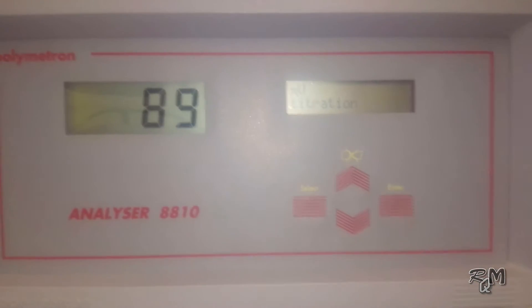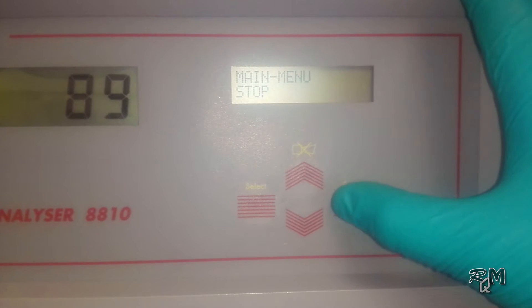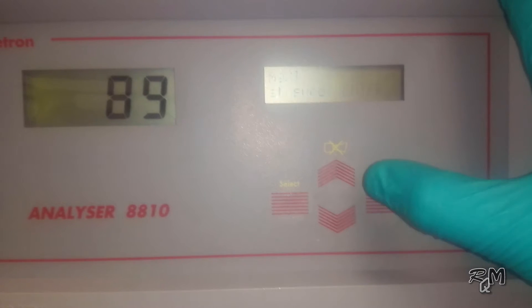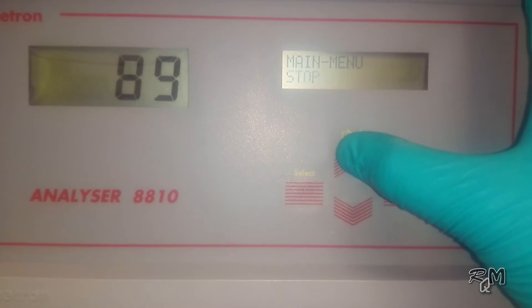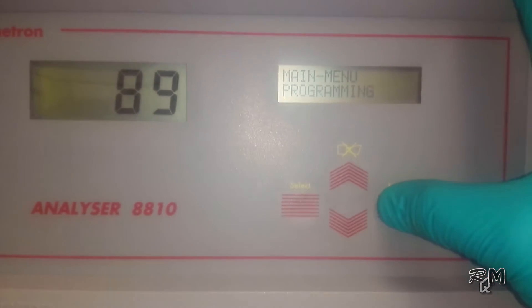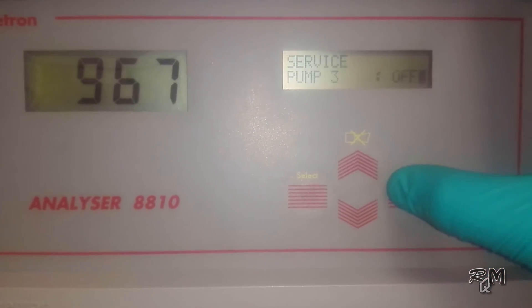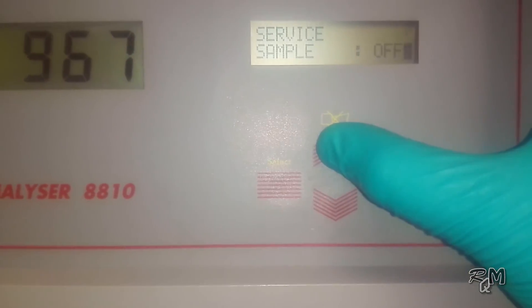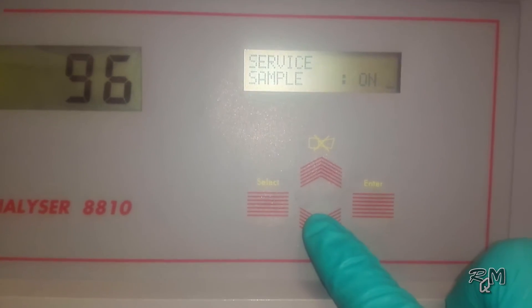For volume verification we will again use the service menu. If the analyzer is in service, first stop the analyzer — press the Select key to go to the main menu on the Stop selection, press Enter and confirm stop by pressing Enter again. Now the analyzer is in stop mode. Press Select key again to go to the main menu, press up or down key to move to the programming menu, press and hold Enter key until the measurement menu displays, then go to the service menu and press Enter. Go to the sample pump, switch on the sample pump by pressing up or down key. Observe the sample level — when it reaches the overflow tube top, allow sample to flow through the overflow tube for 10 to 20 seconds. Then switch off the sample and confirm siphon activation.